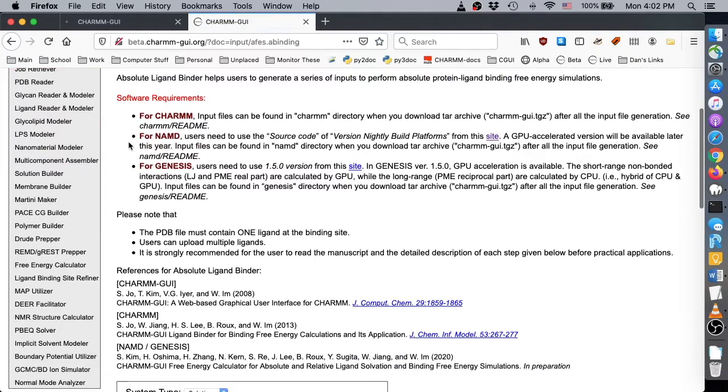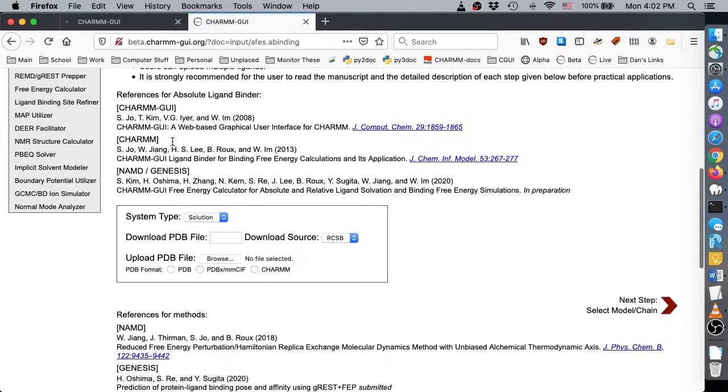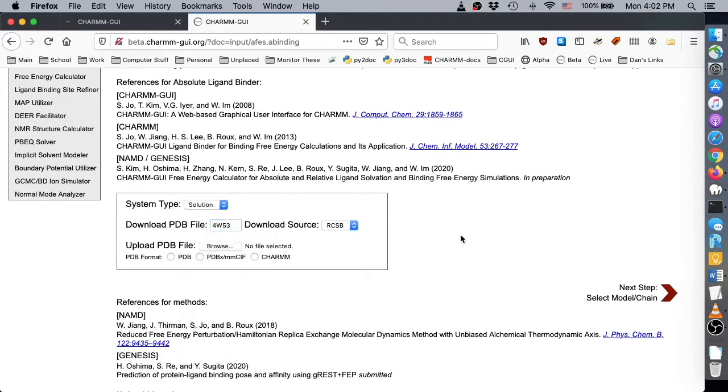Absolute Ligand Binder can generate inputs for NAMD, Genesis, and Charm. The first few steps of Absolute Ligand Binder involve reading a protein structure. You can upload your own structure or enter an RCSB ID.